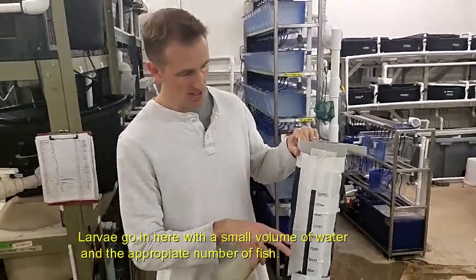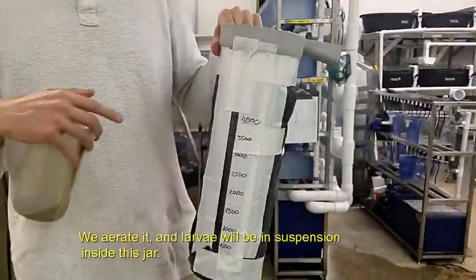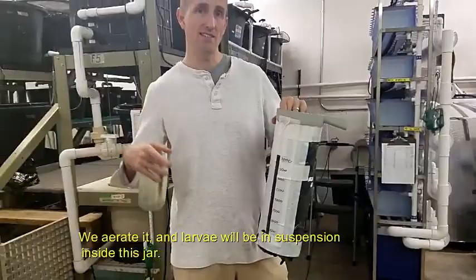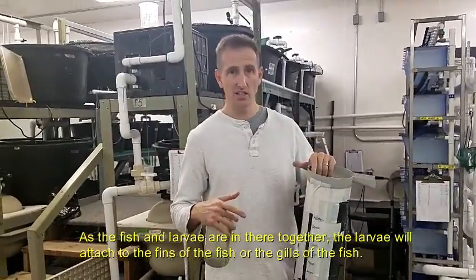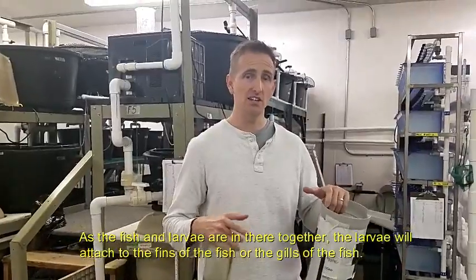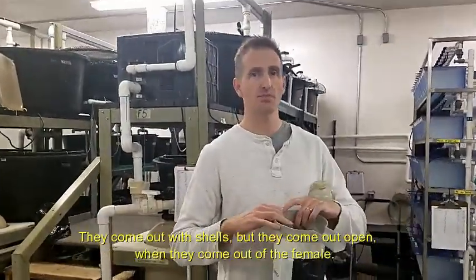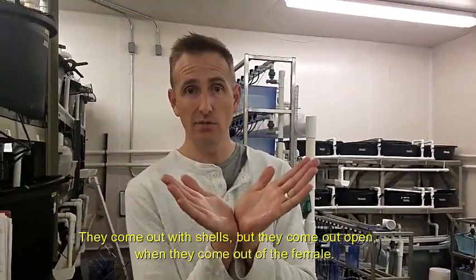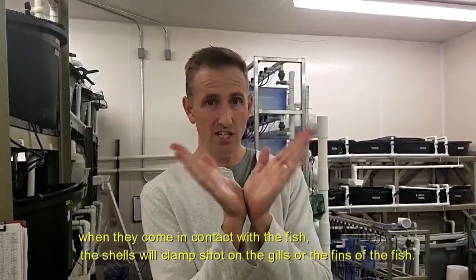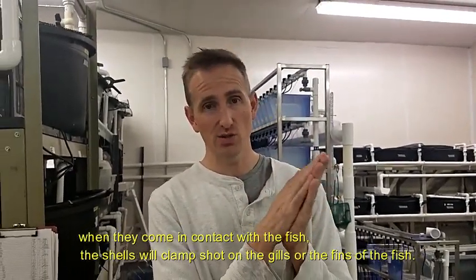Larvae go here with a small volume of water and the appropriate number of fish. We aerate it and the larvae will be in suspension inside this jar, and as the fish and the larvae are in there together, the larvae will attach to the fins or the gills of the fish. They come out with shells, but they come out open when they come out of the female, and when they come in contact with the fish, the shells will clench up on the gills or fins of the fish.